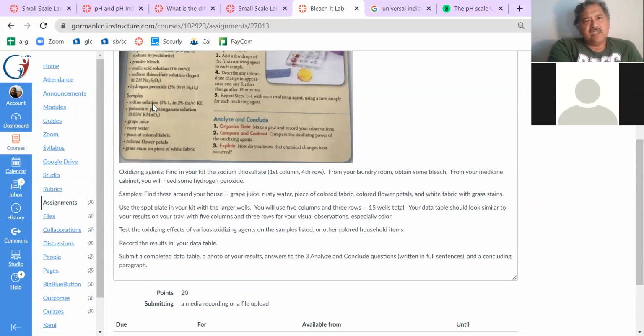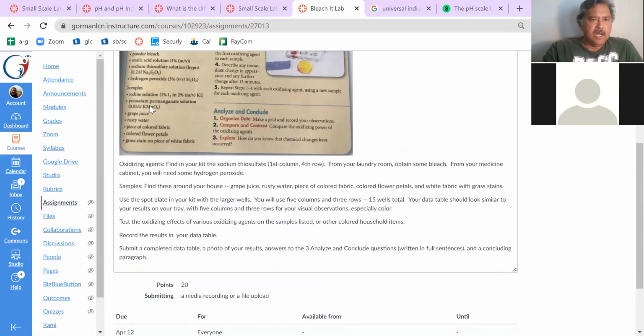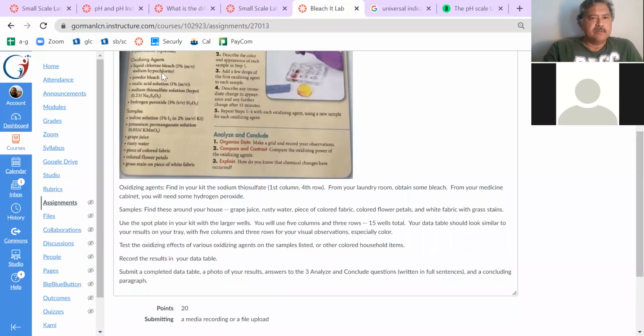Same with actually the hydrogen peroxide. You may have gotten a cut and then had someone pour it on your cut and then it bubbles. That is something you may or may not do. So that is the hydrogen peroxide right there. So your oxidizing agents are bleach, sodium thiosulfate, and hydrogen peroxide. So you're going to have 3 of them.